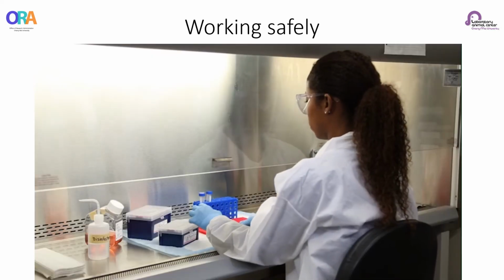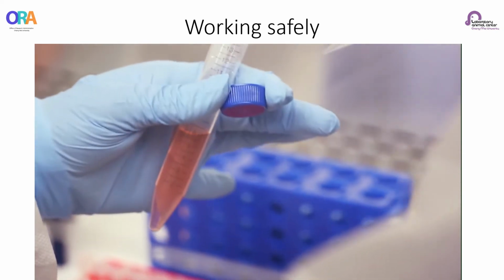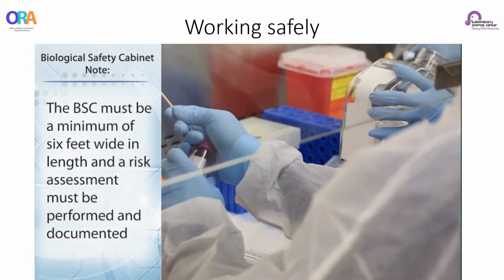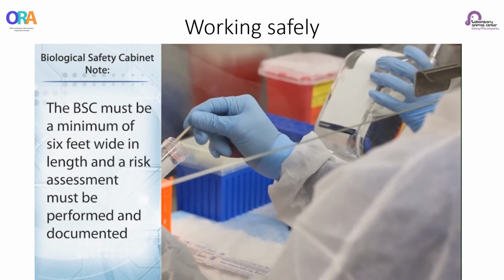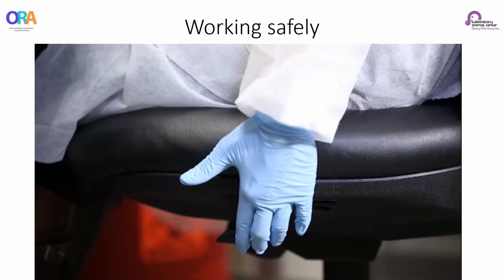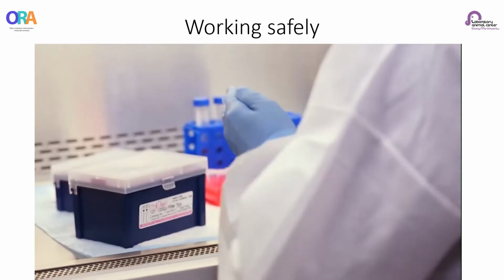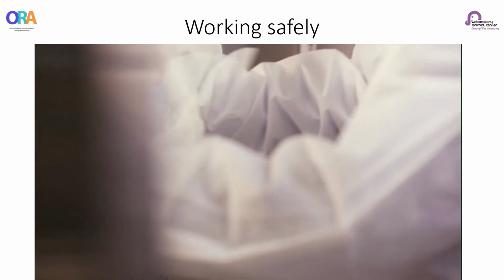While working in a BSC, you should be seated, and only one person should work in the BSC at a time. If two people need to work in the BSC at the same time, the BSC must be a minimum of 6 feet wide in length, and a risk assessment must be performed and documented. Sit down at the BSC and adjust the height of the chair so your face is above the opening and behind the glass. Your arms should be bent at a 90-degree angle at the elbow while inside the BSC.